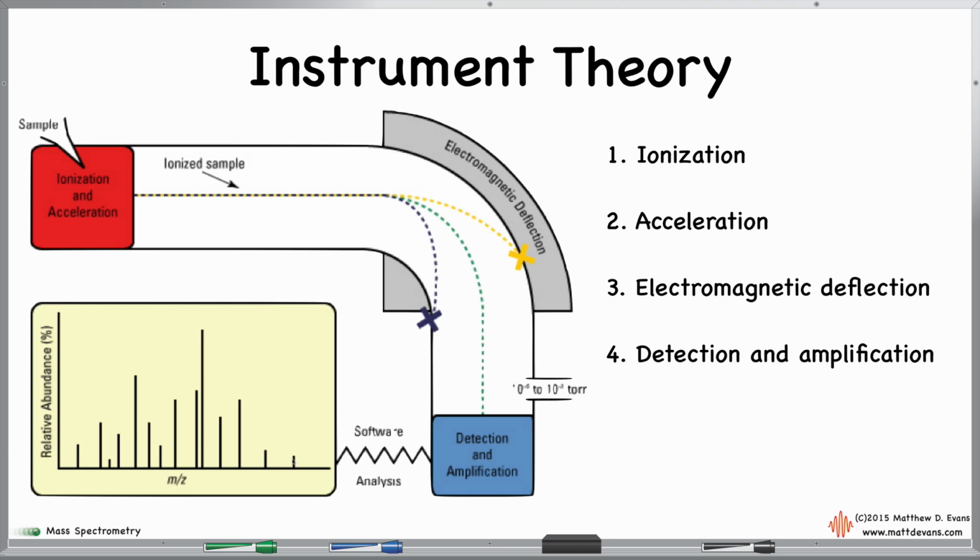Okay, now that's how these older mass spectrometers work. They use these magnetic fields like this. Like I said earlier, the more modern approach is to use a quadrupole, but the idea is the same. You're just filtering different masses of molecules through it. It just works a little bit differently. And these newer instruments are much smaller too. The older mass spectrometers used to take up, rumor has it that Shasta College used to own one, and it took up half a warehouse or something like that. Some ridiculous rumor about that, but they were much bigger back in the good old days.